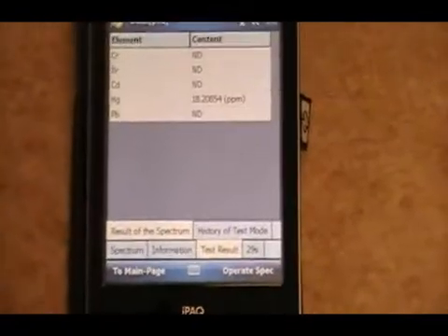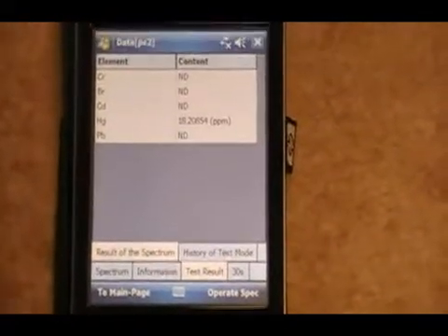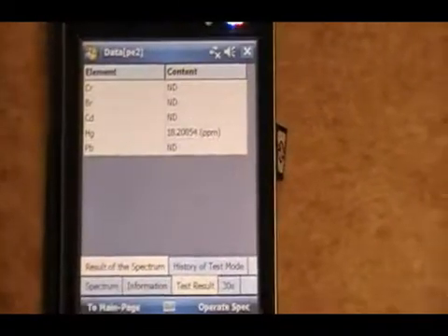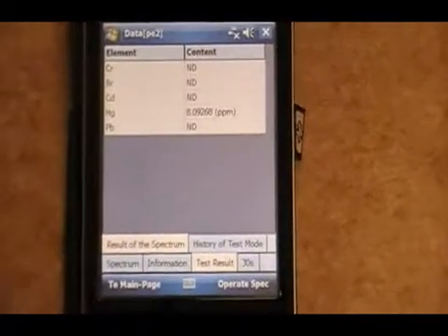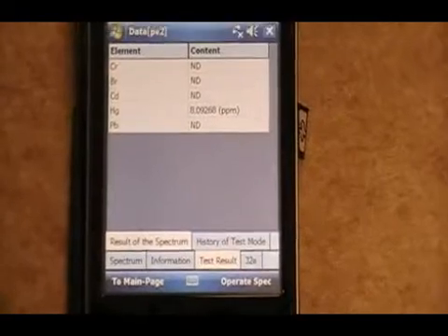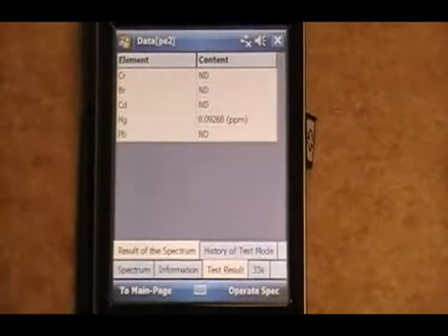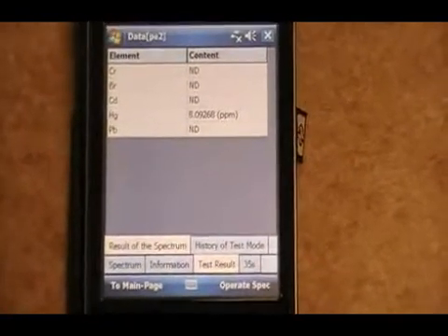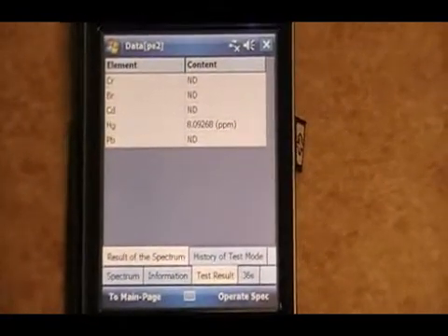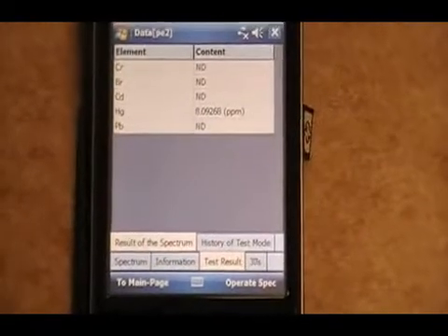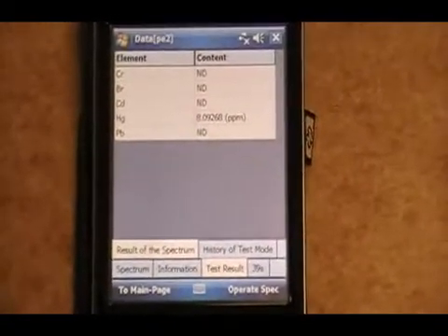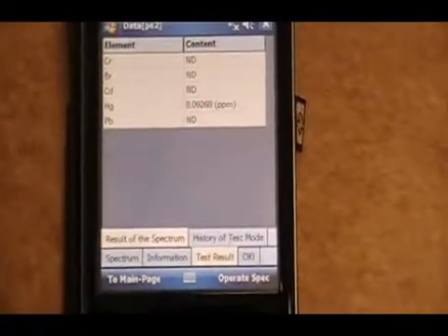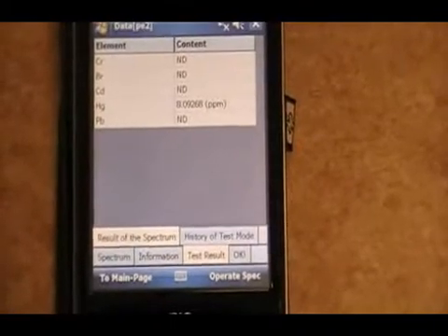We're going to run it for 100 seconds. We've found that it's kind of the best balance for the customer of a precise number as well as a decent run time. Their hands don't get tired holding the unit up.